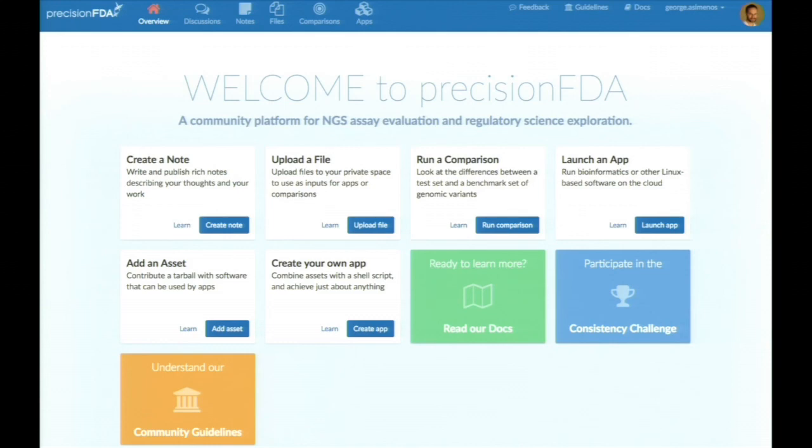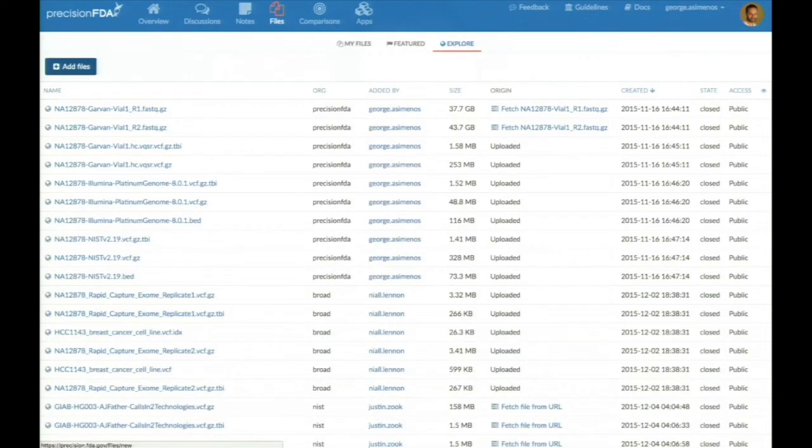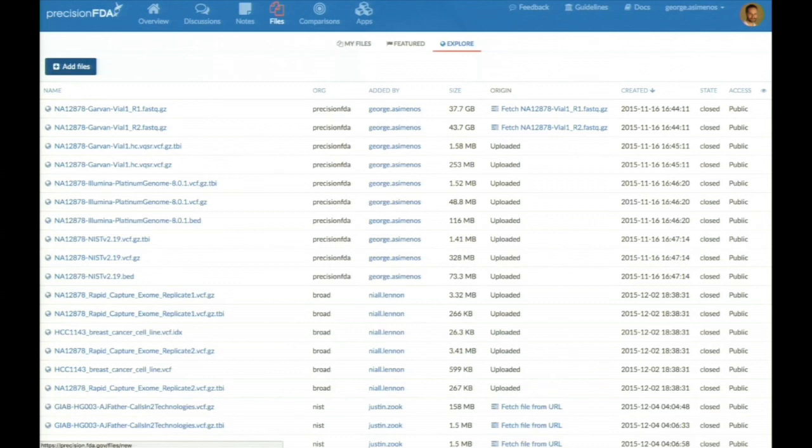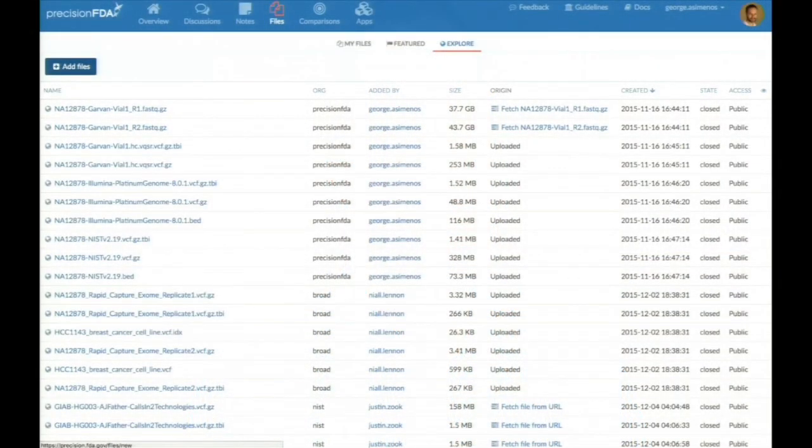For example, if we click on Files, we see a list of files that are being shared with the PrecisionFDA community, and that's a feature where anyone can download or share files with the rest of the participants. For example, this dataset here that is called NA12878-NIST is the characterization of reference material by NIST. Anyone on PrecisionFDA can upload their VCF file and compare it against NIST.